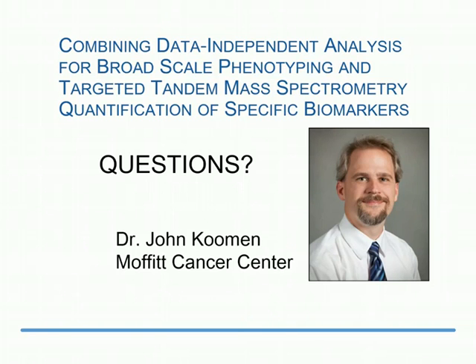Okay, next up is, why do you have confidence in spectral library matching as compared with data-dependent analysis?